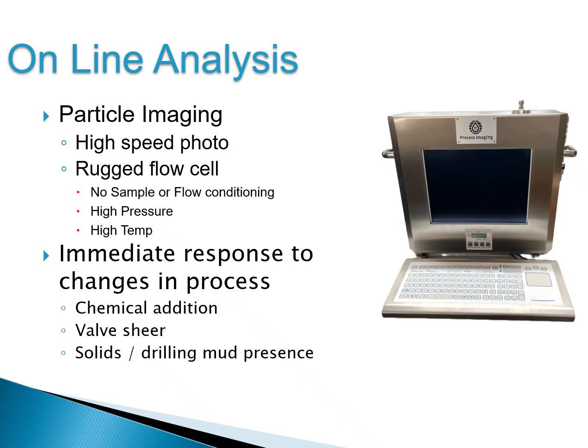So regardless of what the operator needs or what the process needs, there's about 4 or 5 different ways of preparing samples and looking at water samples to know what's in there.